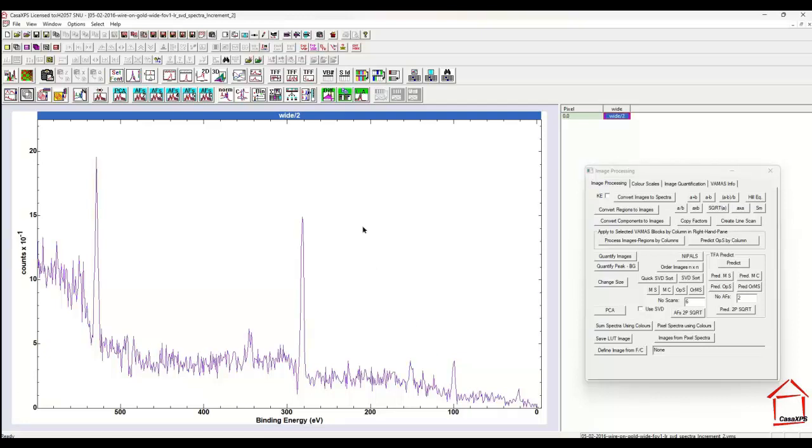So when you're performing a mathematical operation on data such as these, like PCA, it's understandable why you might lose sight of some of the smaller peaks, and in particular the peak that has been lost, I would suggest, in the set of images when we do the PCA directly on the raw images, is the gold.